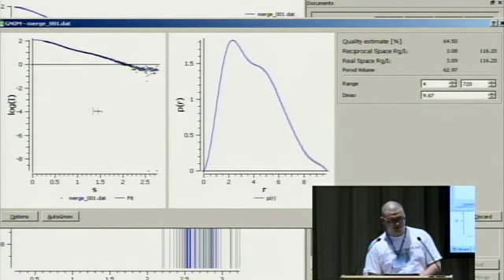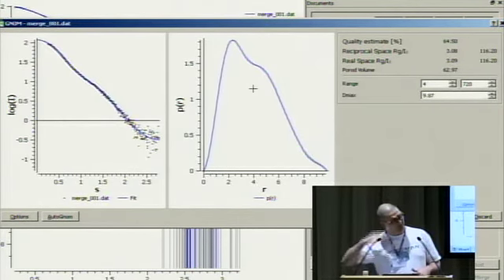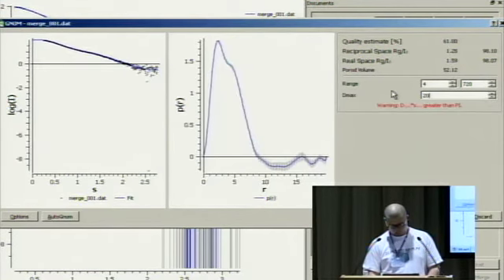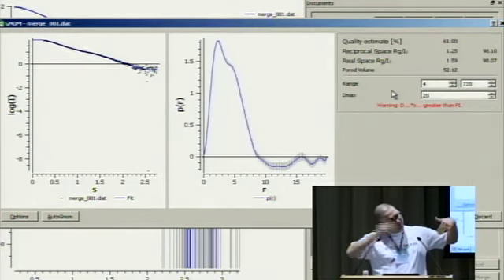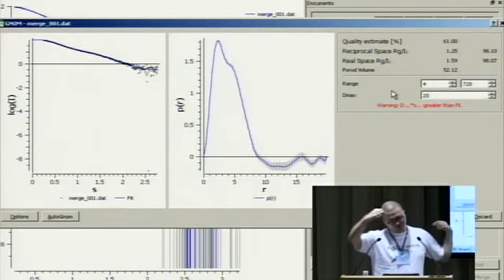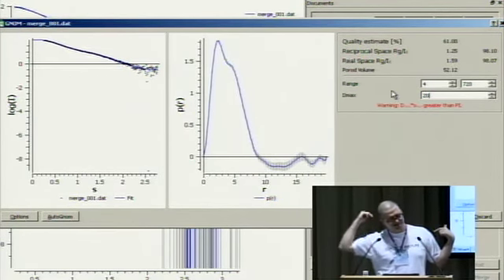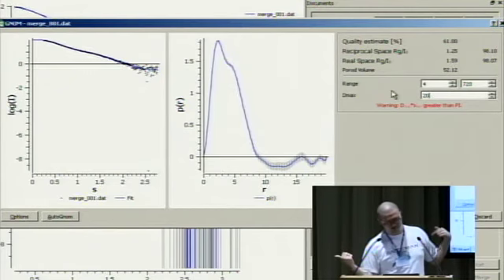For example, the P(r) function has a wobbliness parameter. You quickly have seen an intermediate solution that was very wobbly. If you have a very wobbly P(r) function with a lot of peaks, it will probably see that and take that into account in the quality estimate.